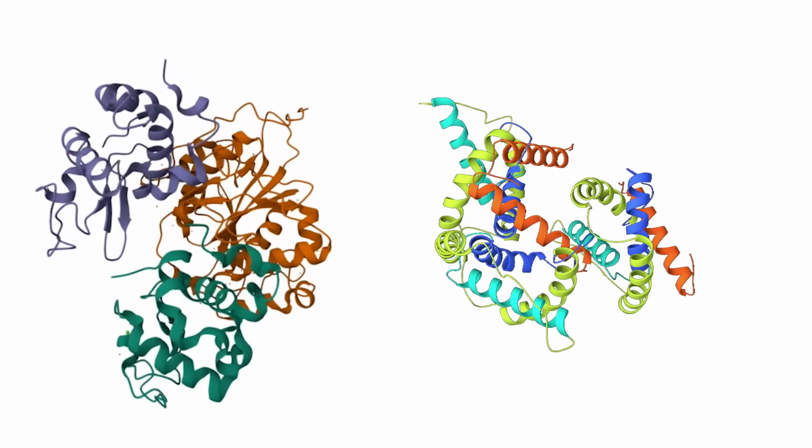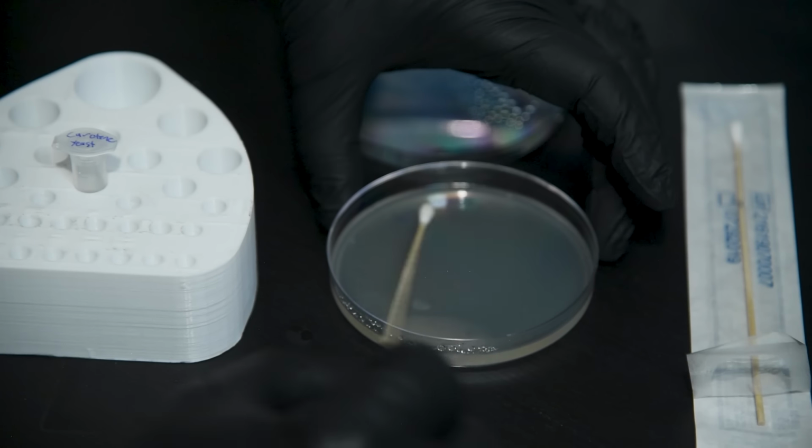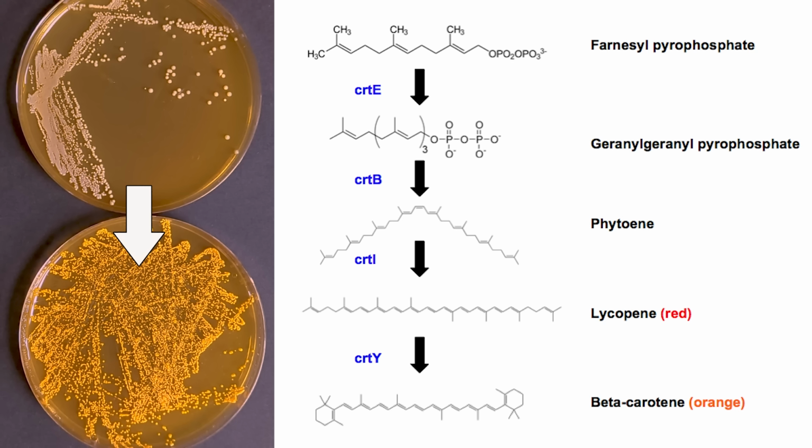But what happens if we want to express multiple enzymes? For example, in a previous video, we made yeast produce beta-carotene and turn the cells bright yellow and orange. But beta-carotene synthesis takes a bunch of steps, so we used a construct that had multiple operons.